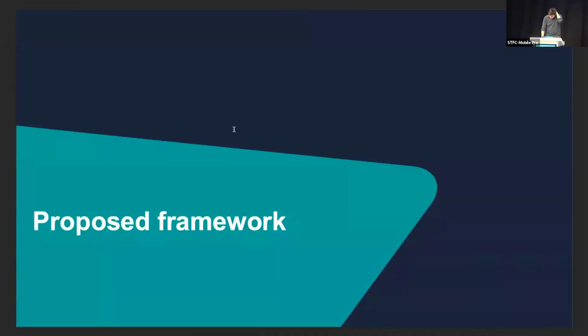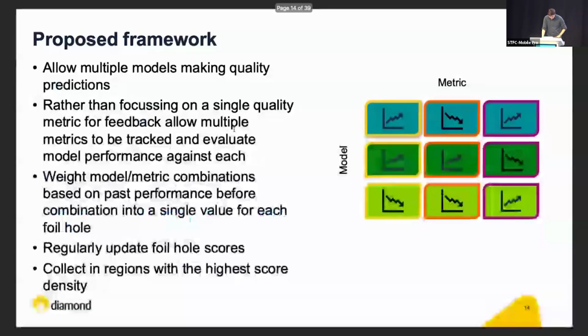So now I'm going to talk about the framework that we've been using to try this out, to try and actually progress this more towards being able to offer some automated SPA. So a key thing for us is flexibility. I don't think you'll be able to train a single model that is just pre-trained and just works for every data set.